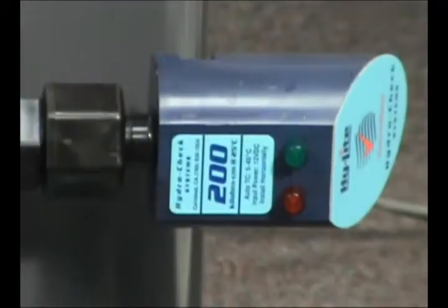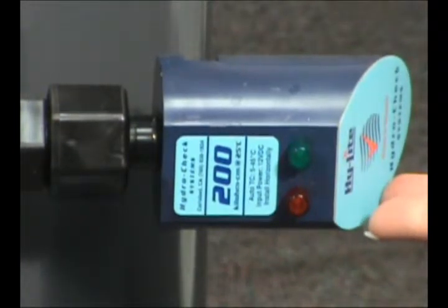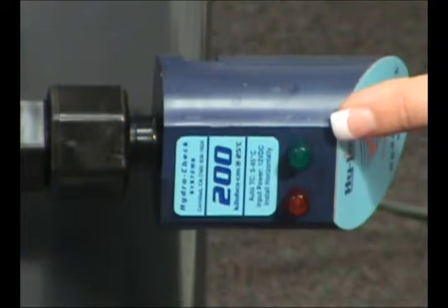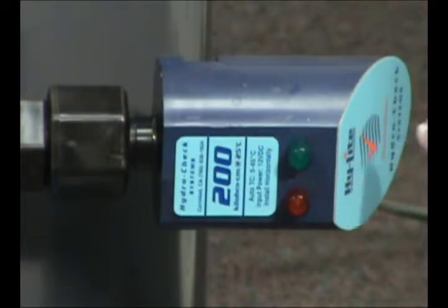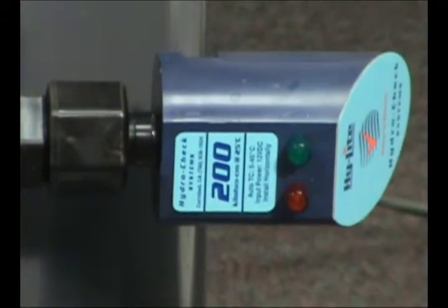The resistivity monitor light measures a minimum of 200,000 ohms per centimeter of resistivity. A green light indicates water quality is good. If the resistivity drops below 200,000 ohms, the light changes to red and an alarm sounds, indicating it's time to change the resin packs inside the Deionizer.